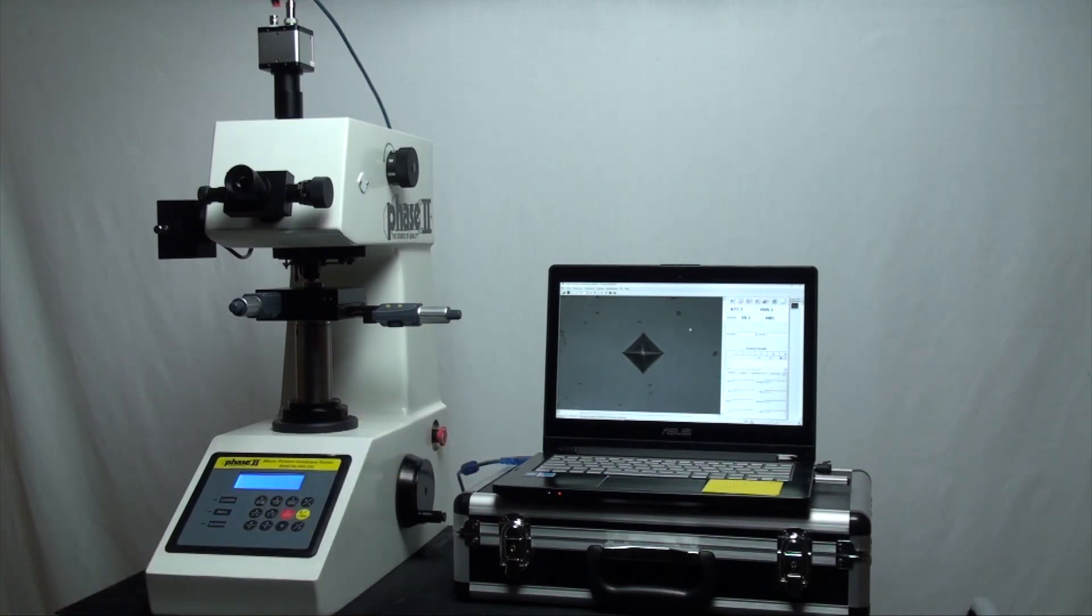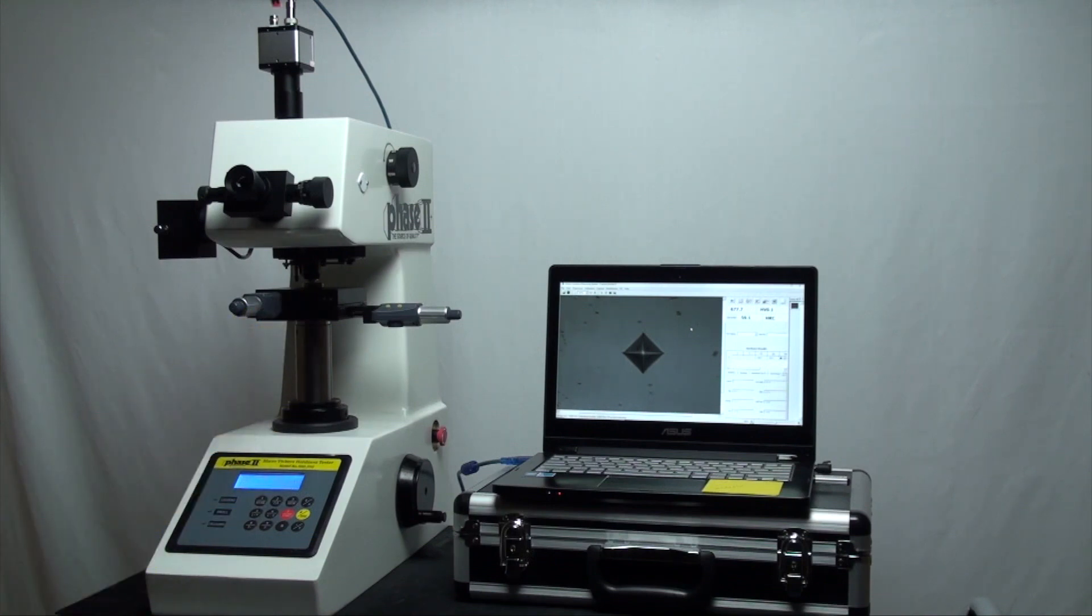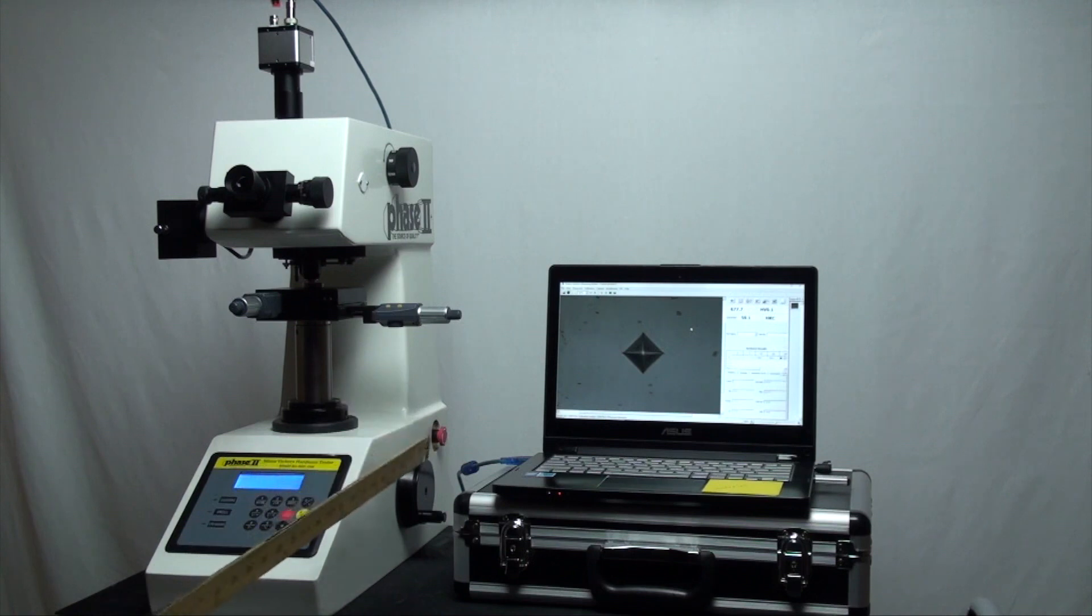Here's the XY stage with digital micrometers and Z-axis manual height and focus control.